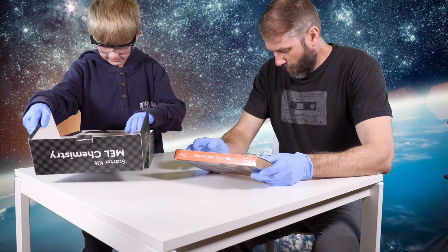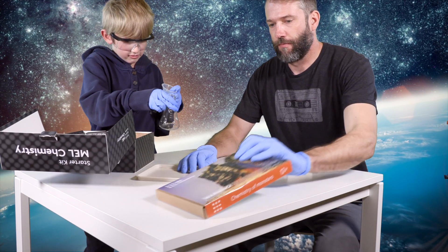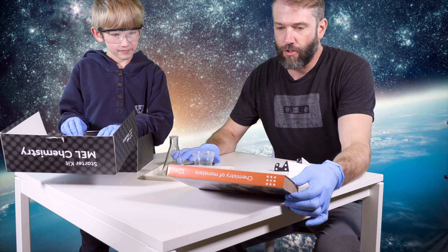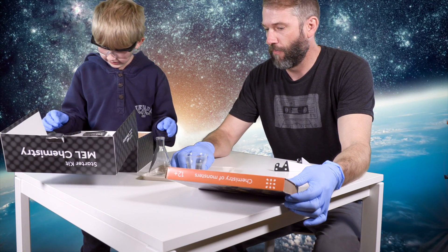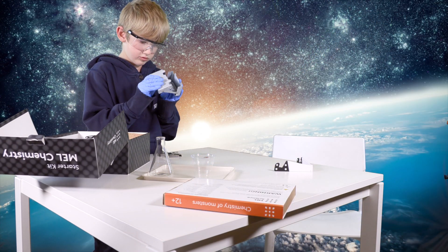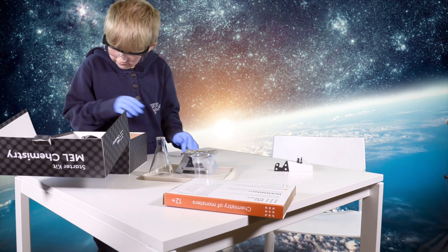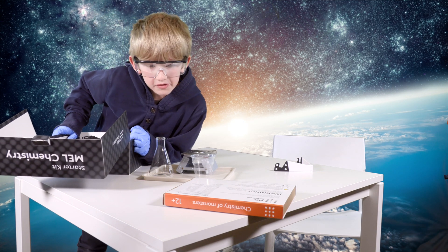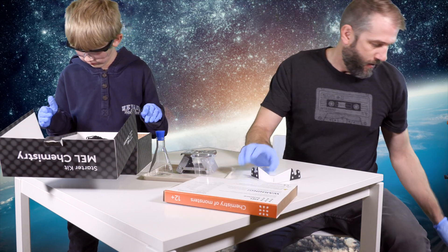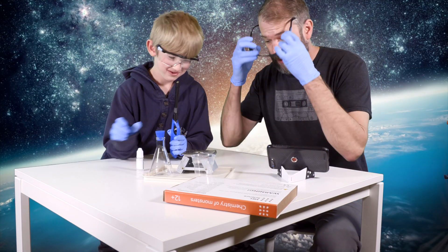So we need the Erlenmeyer flask - the triangle one. Another disposable cup, just one. Plastic tray, which is this here. We need the pocket stove. Go ahead and get the pocket stove out. We also need a rubber stopper with two holes. Safety glasses and smartphone stand. Here's the smartphone stand. All I have is this iPhone. A fuel and the lighter.